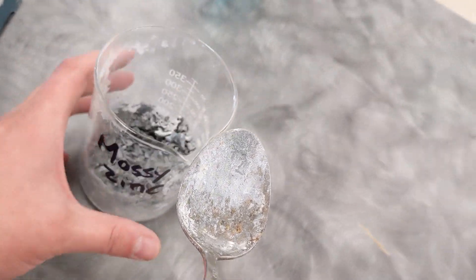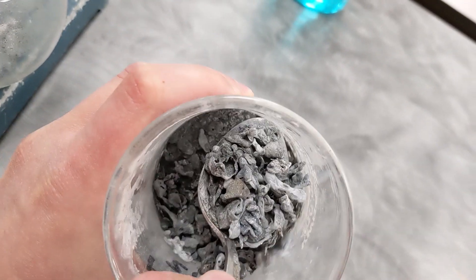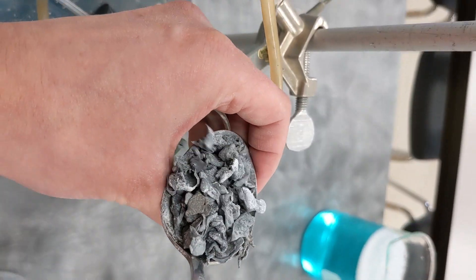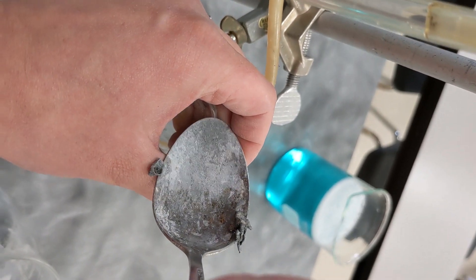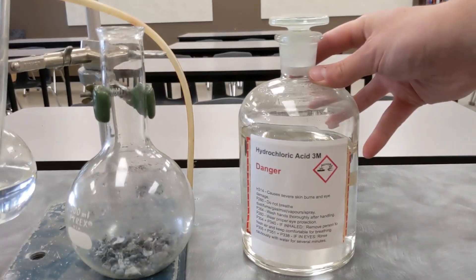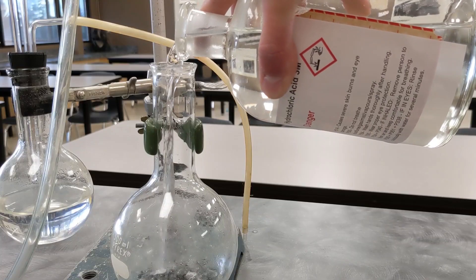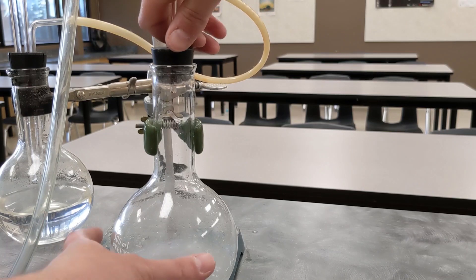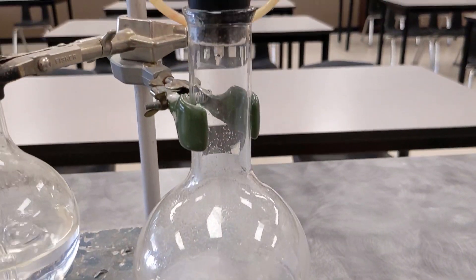Maybe one more scoop — that looks good. We're going to use three molar hydrochloric acid. The amount isn't particularly important; if the gas generation slows down, we'll add a little bit more.